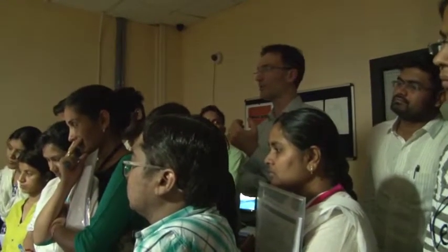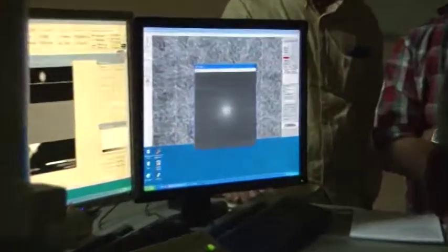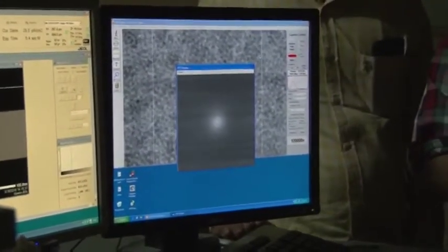Again, they are out. But this means that there is also some contrast inversion in the atomic resolution image, as we will see next week. So from bright atoms to dark atoms, there is some dependency on the defocus all the time. A strong dependency, deliberately spoiling it, let's say.